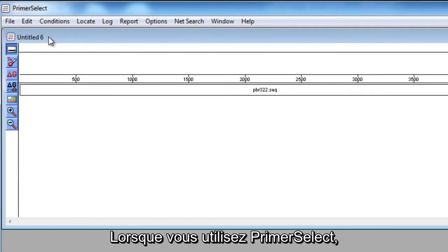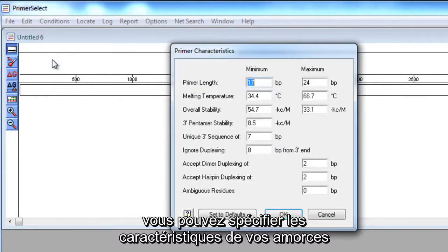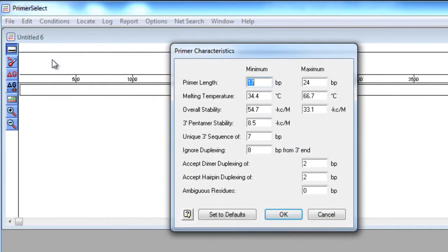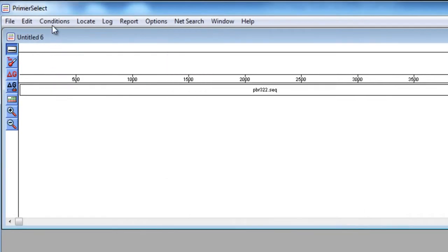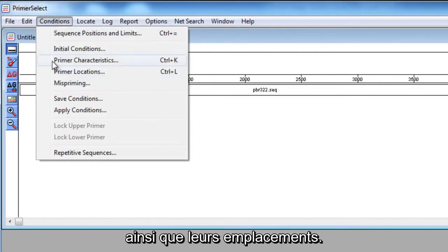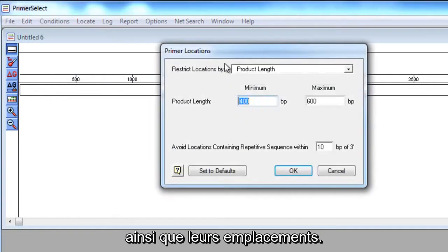When using Primer Select, you can specify your primer characteristics, as well as your primer locations.